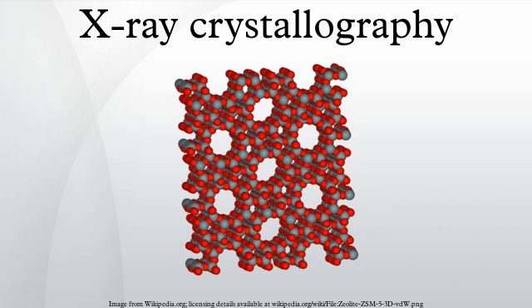Advantages of a crystal. In principle, an atomic structure could be determined from applying X-ray scattering to non-crystalline samples, even to a single molecule. However, crystals offer a much stronger signal due to their periodicity. A crystalline sample is by definition periodic. A crystal is composed of many unit cells repeated indefinitely in three independent directions. Such periodic systems have a Fourier transform that is concentrated at periodically repeating points in reciprocal space known as Bragg peaks. The Bragg peaks correspond to the reflection spots observed in the diffraction image.